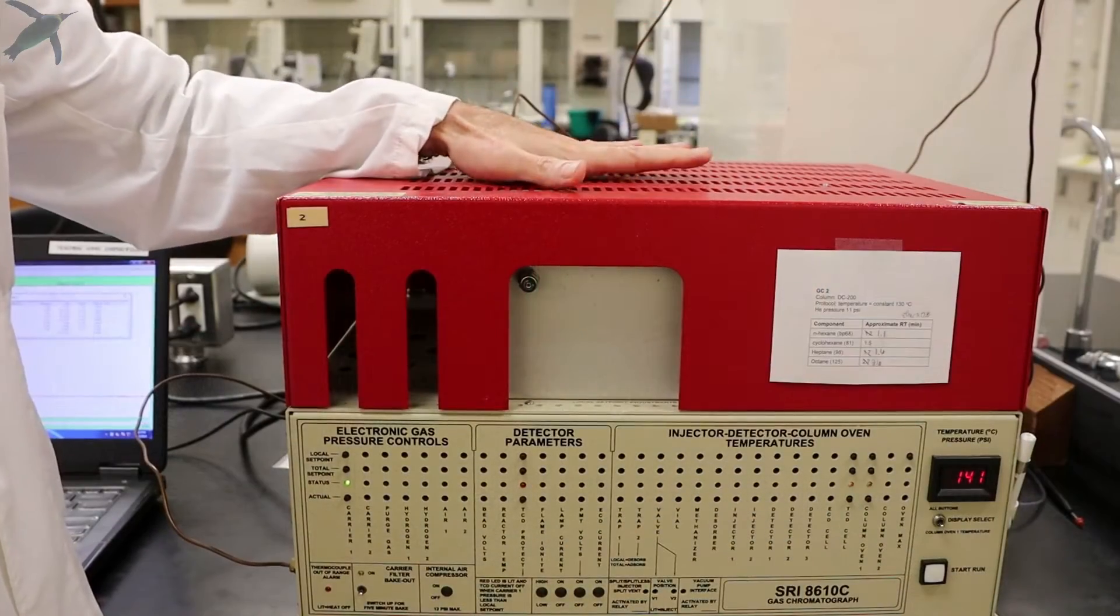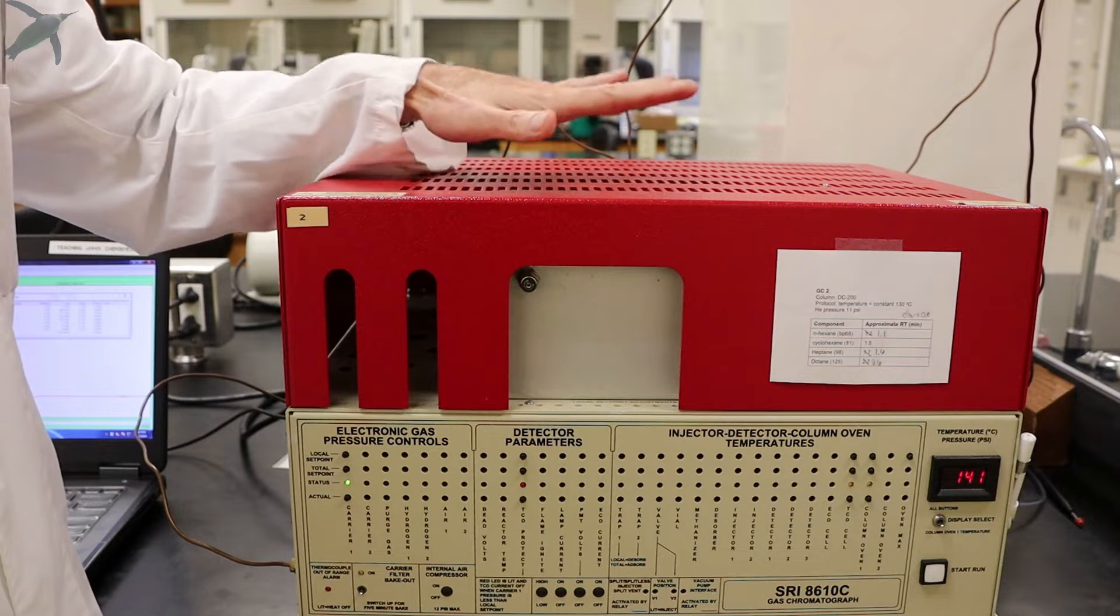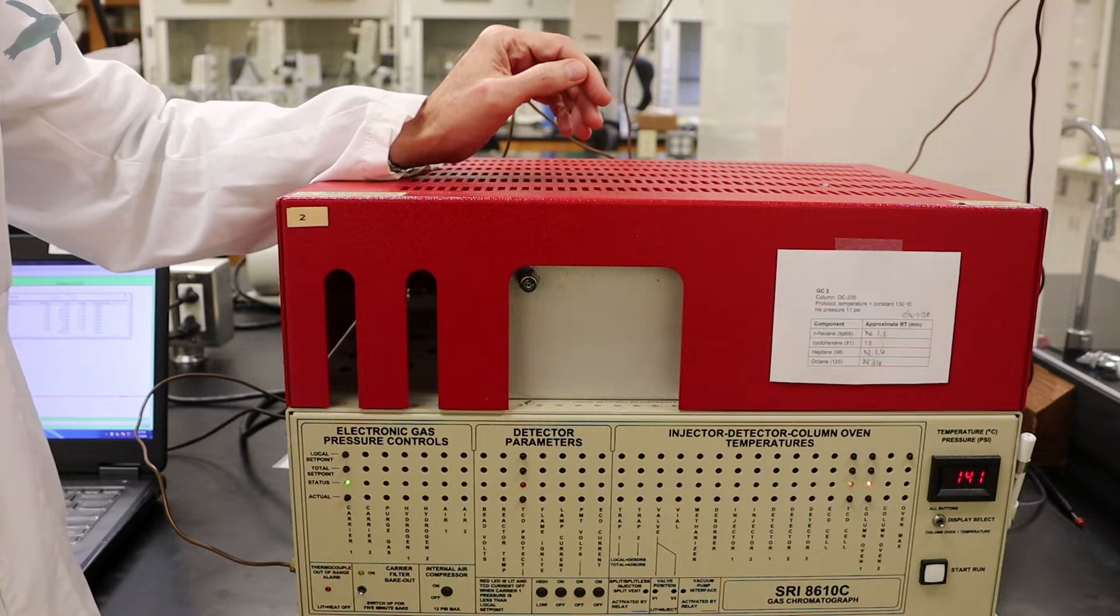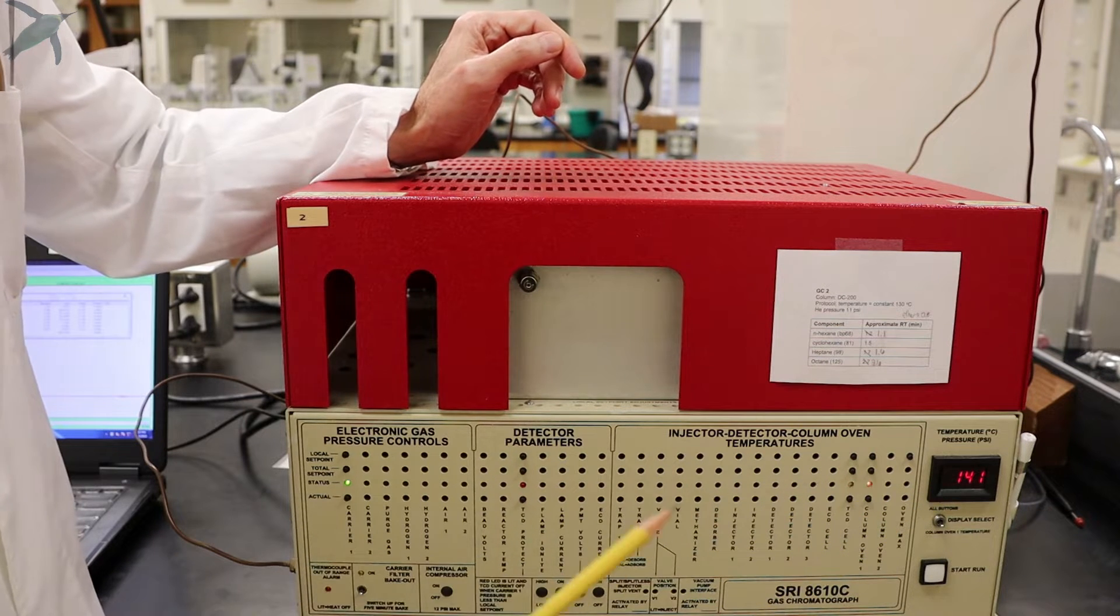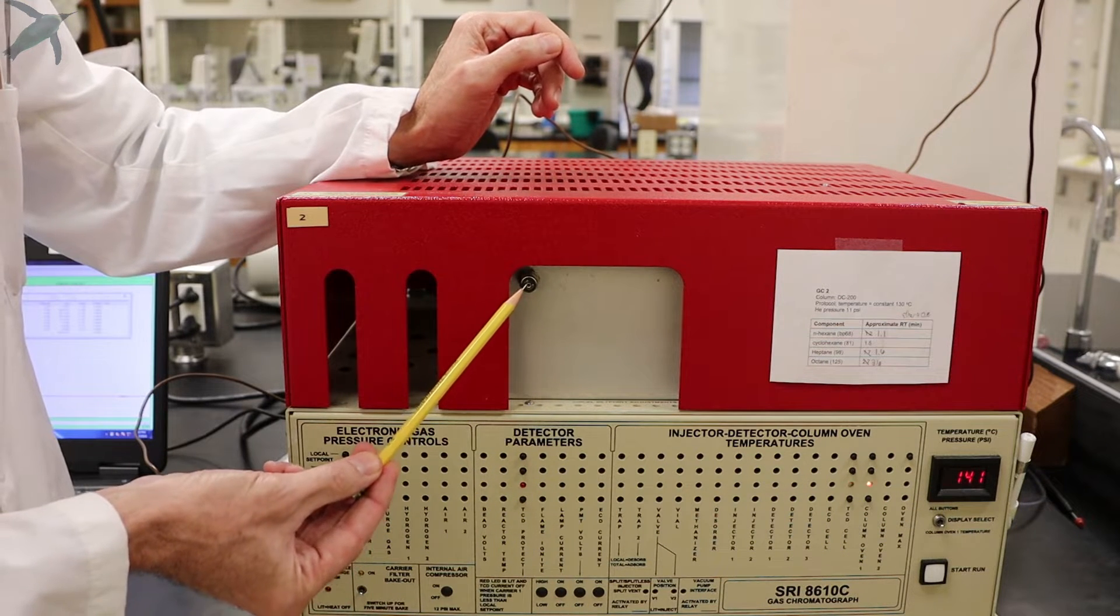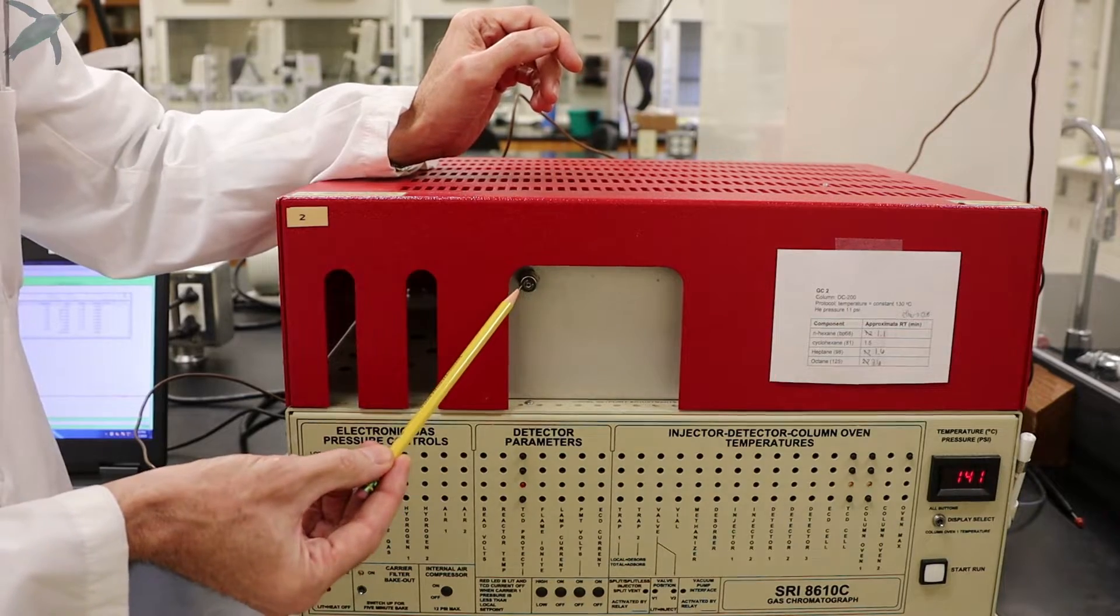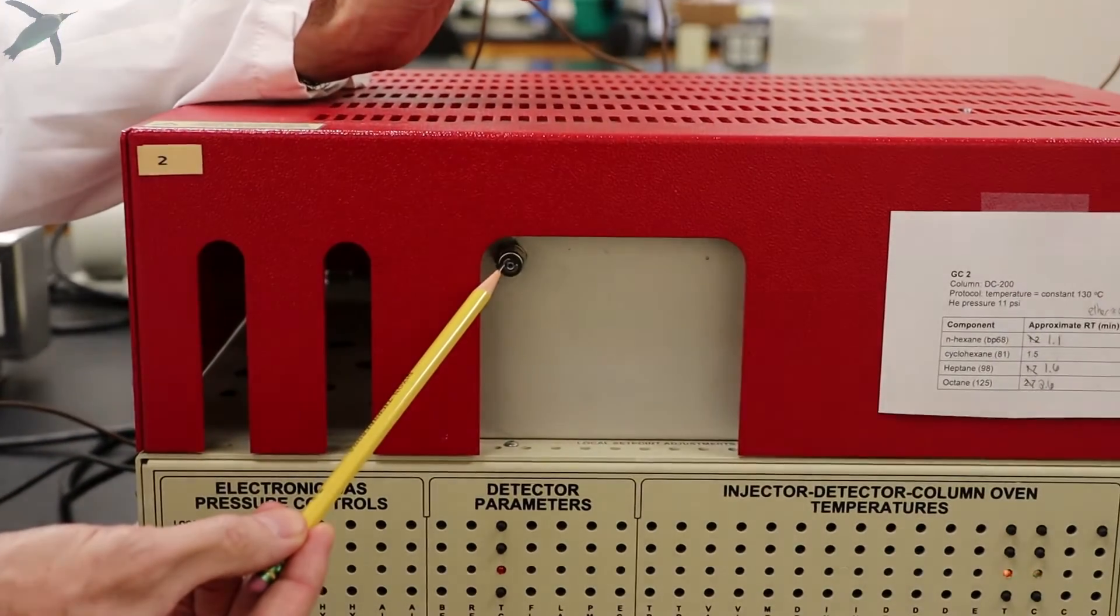This is the gas chromatograph itself. If you look at the front of the instrument, you can see the temperature of the oven displayed here, and you can see the injector port. That's where you will inject your sample through a syringe.